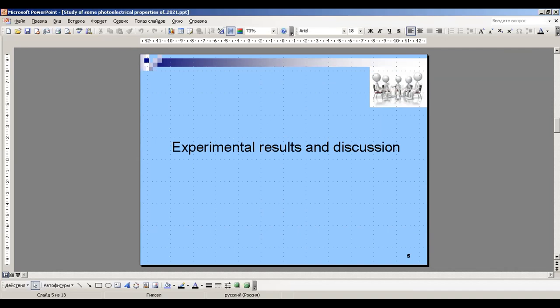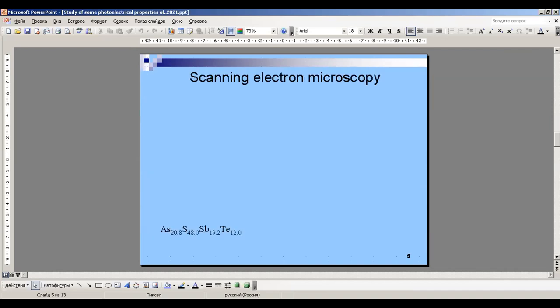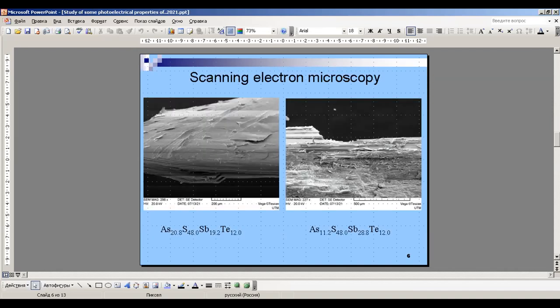We move towards results and discussion. You can see here two images of the scanning electron microscopy. From this investigation, we can see good layers of nanocrystals and nanometer-scale materials.